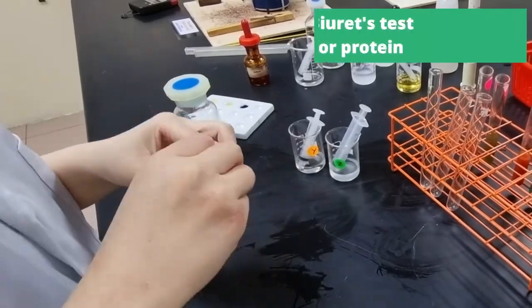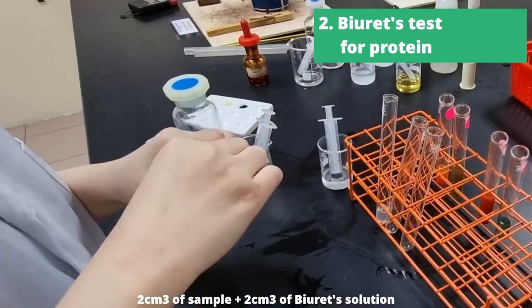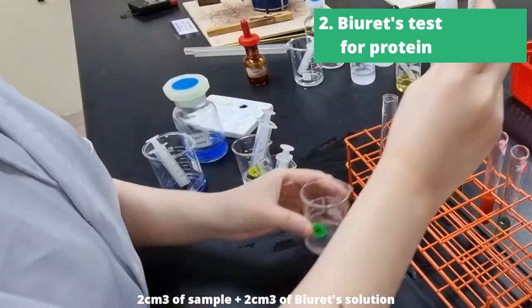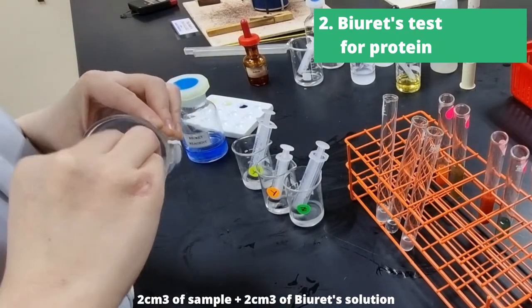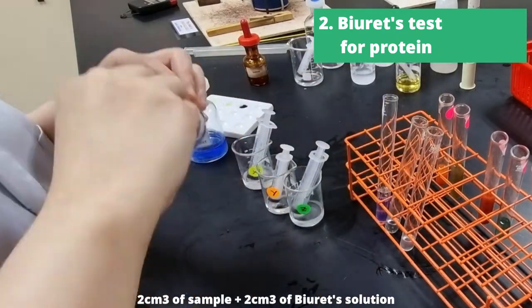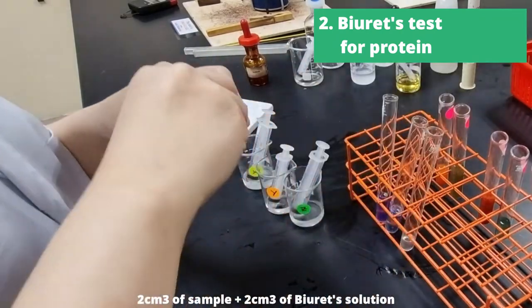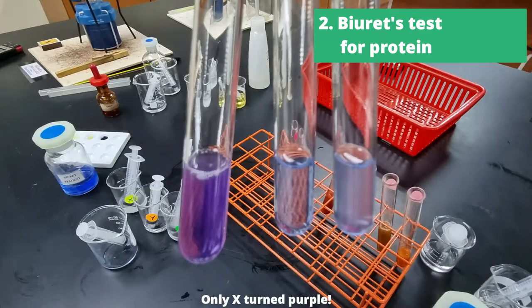Now we can move on to our next test, which is Biuret's test for protein. We're going to add 2cm³ of the sample to 2cm³ of Biuret's solution, and repeat for unknown solutions X, Y, and Z. These are our results — only X turned purple.